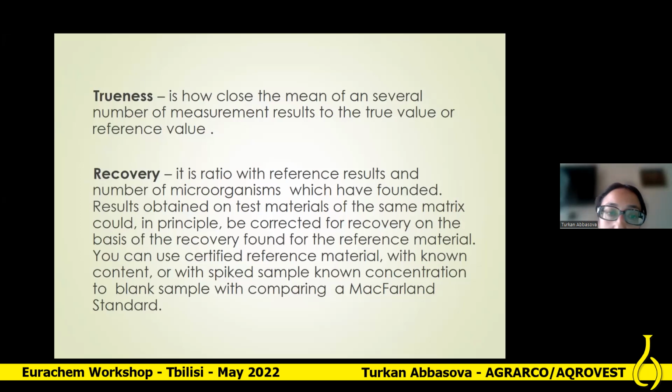As you know, there is the ISO 19036 standard, and all of the standard deviations, recovery figures, etc., should be compared with the tables and the standards requirements. And then the laboratory can interpret them and demonstrate their competency and the reliability of the results in the end.